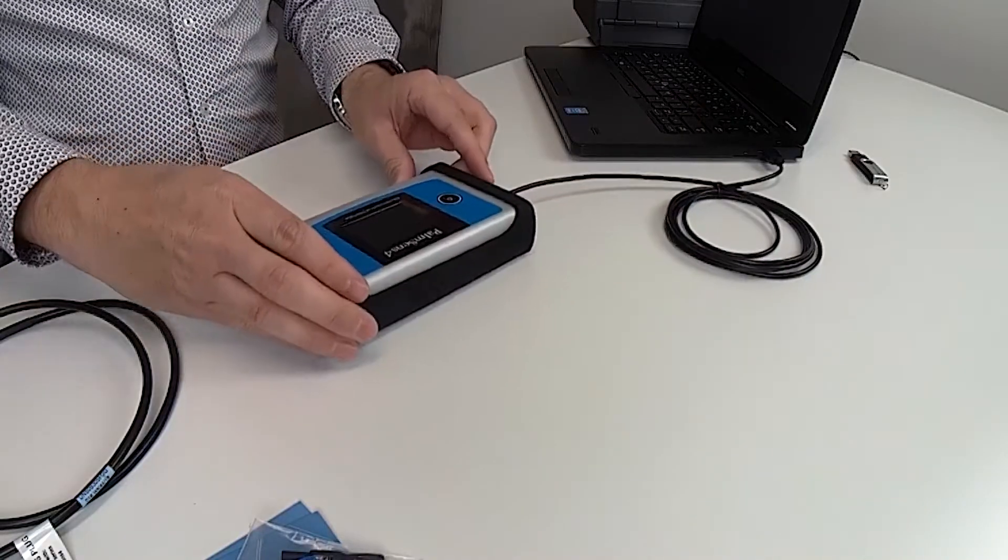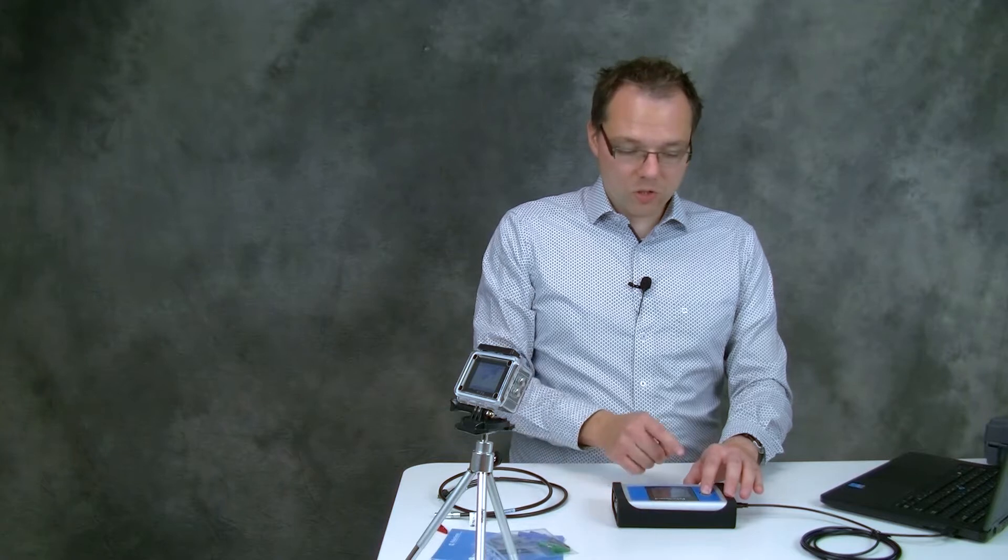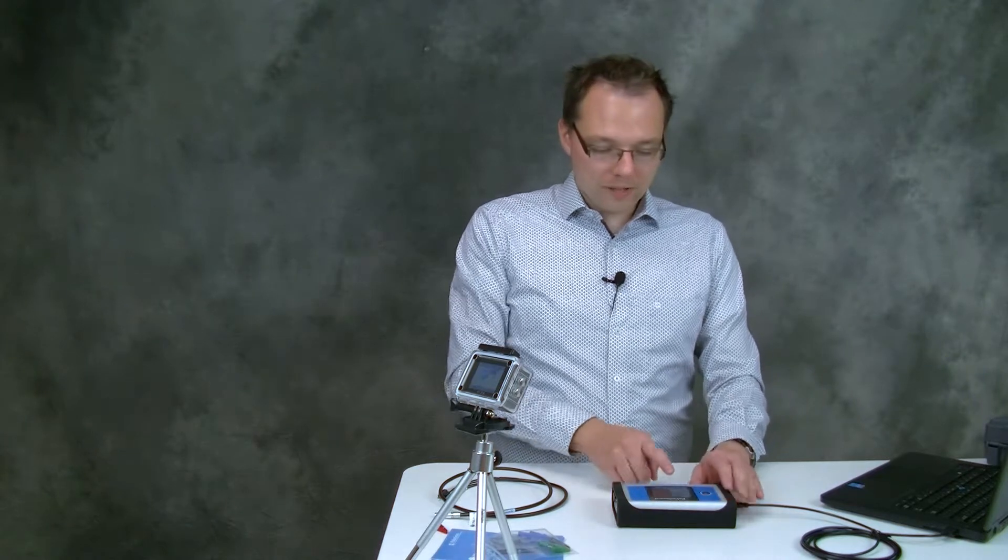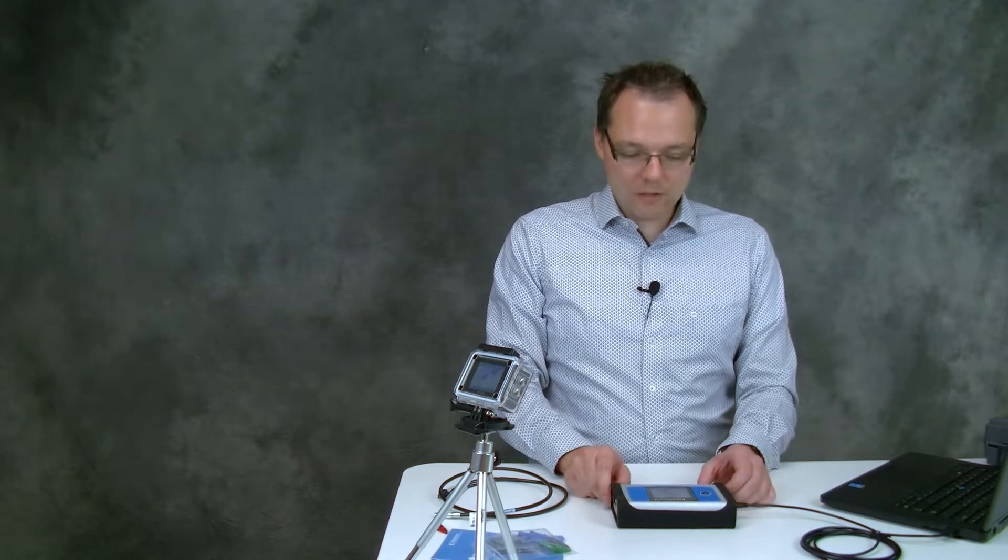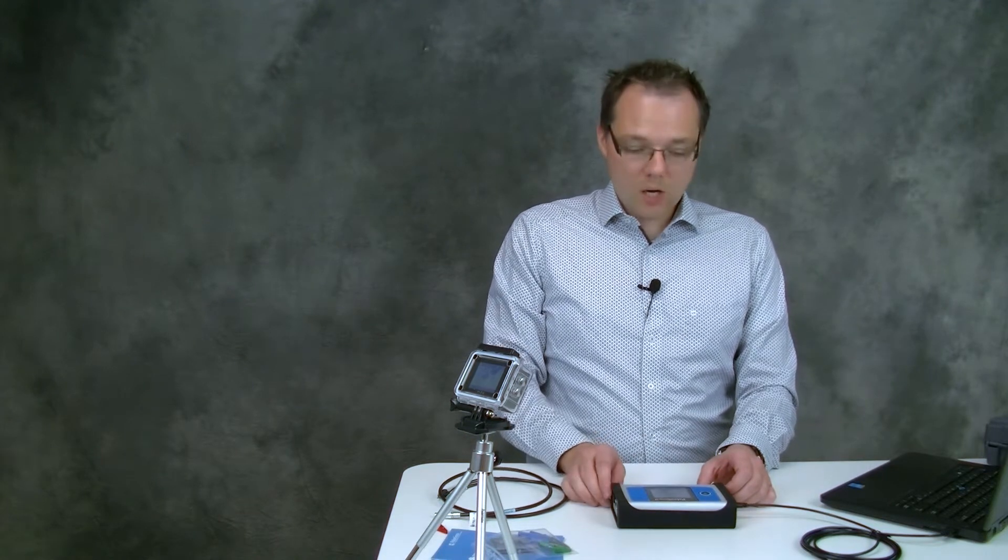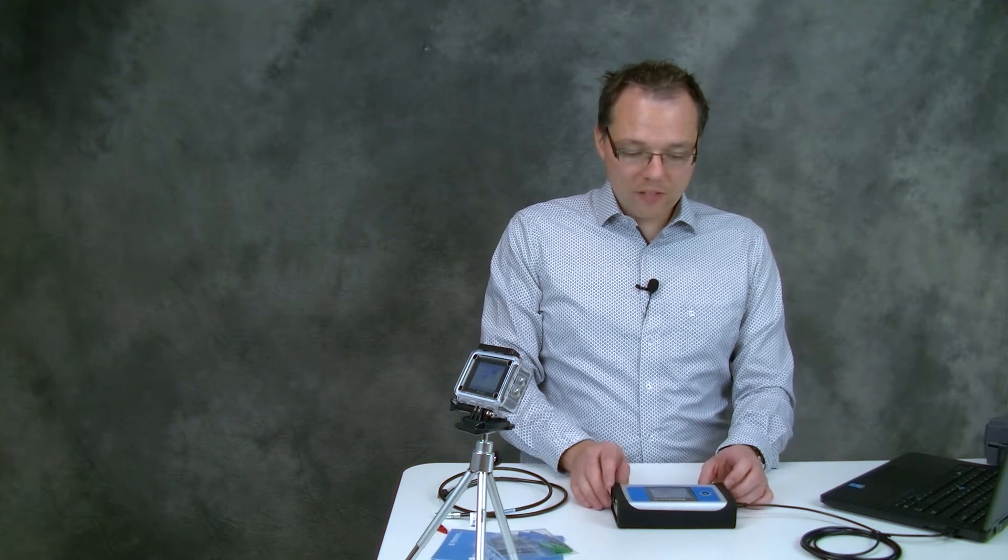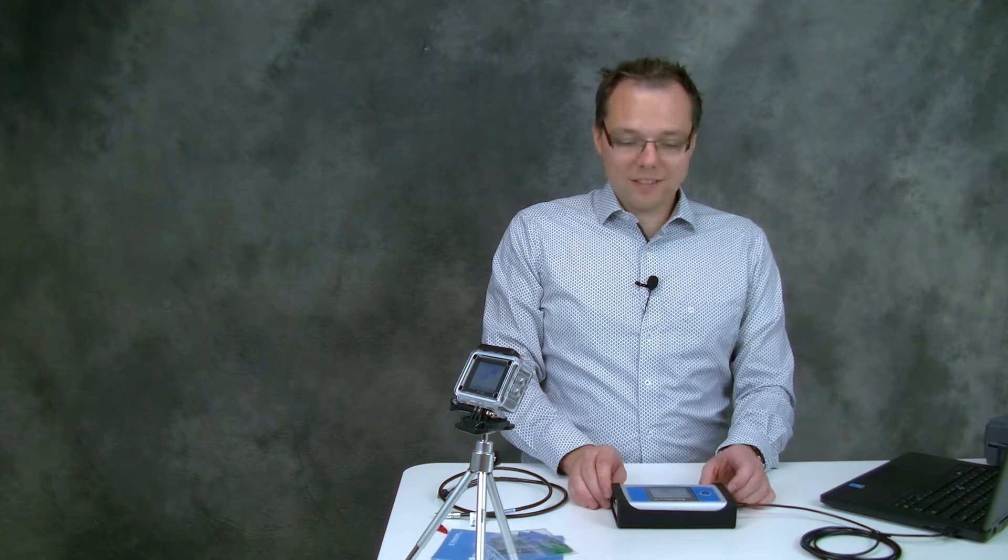To connect the potentiostat to the software it needs to be switched on. Just hold the power button till the Palmsense logo appears on the screen. You will get a short summary of the configuration of this Palmsense 4 and then you get into the standby screen.